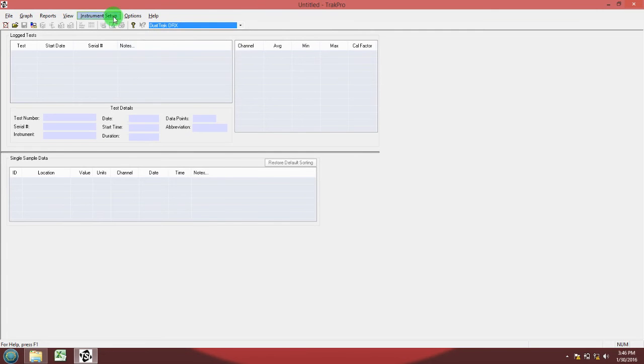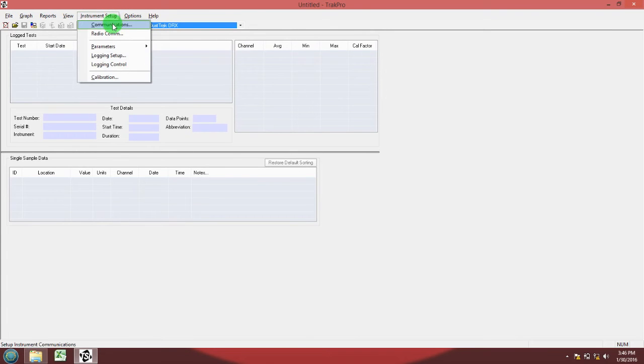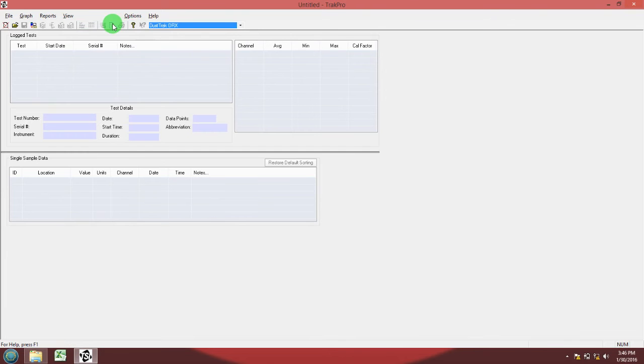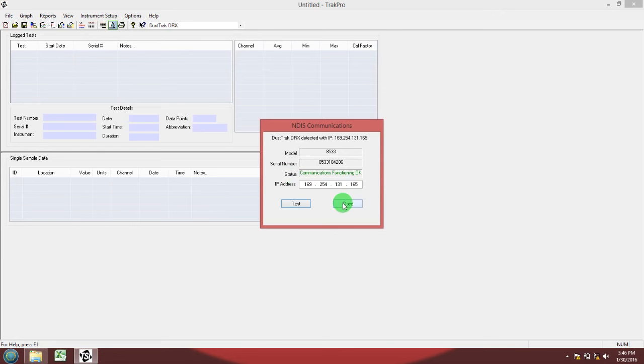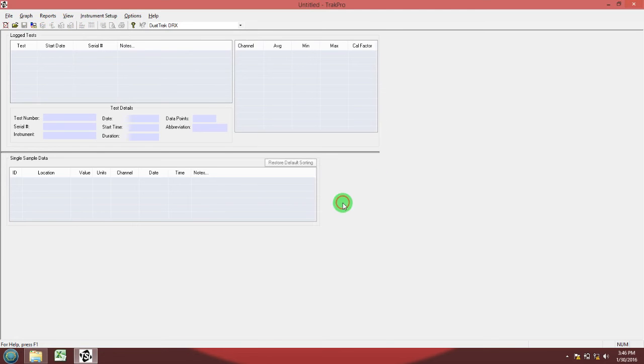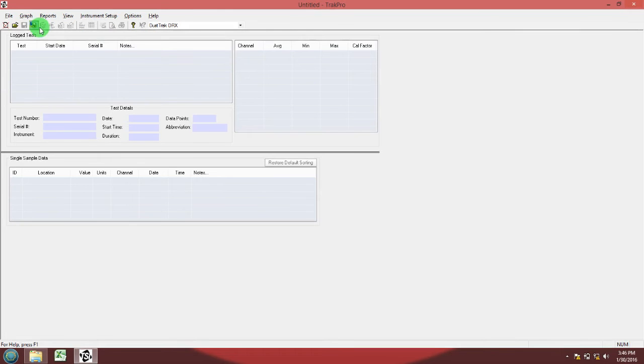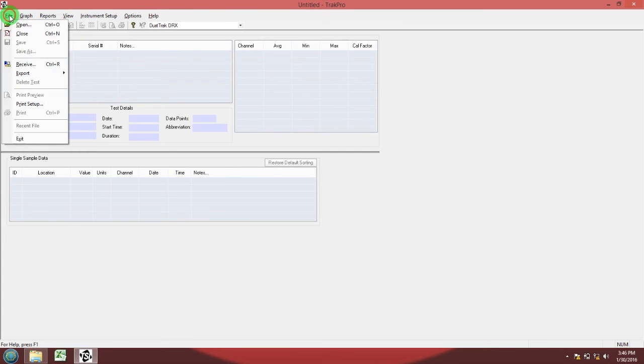Make sure that it is communicating properly with the device by going to communications. You can see right there in green text it says communication is functioning okay. If it was not detecting the device, it would have red text and say communication failure, and in that case you would not be able to download your data.